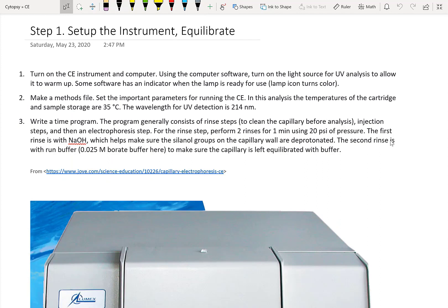Alright, now that we understand the theory, let's get into the practice and go through a protocol that's on JOVE. In this protocol, we're going to look at what are the constituents of diet Pepsi versus normal Pepsi. So step one is, of course, to turn on the instrument. That's easy.